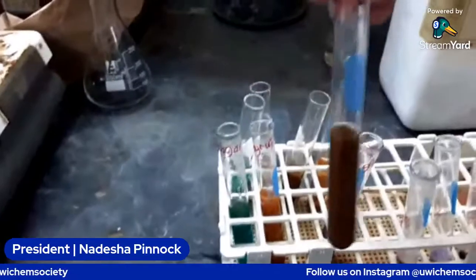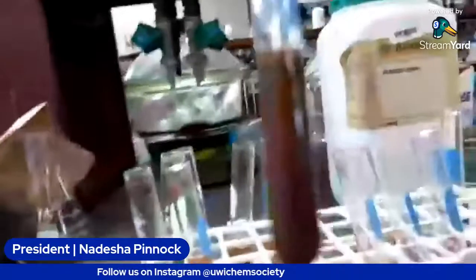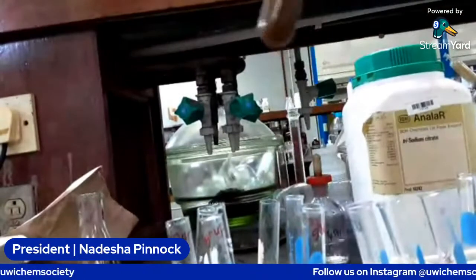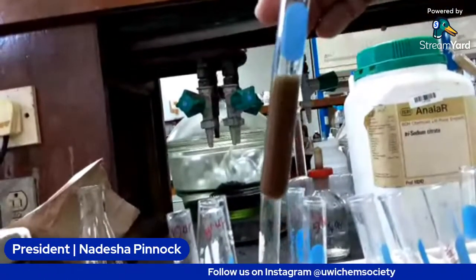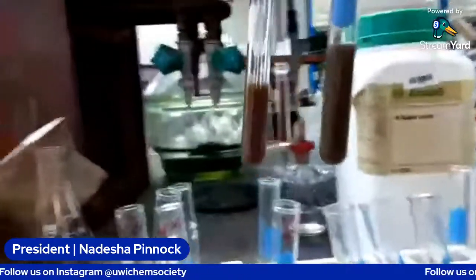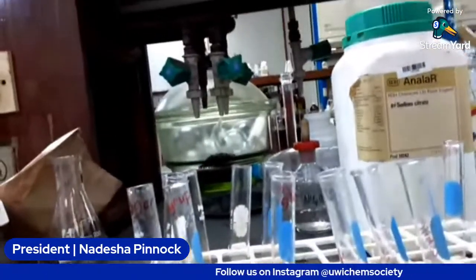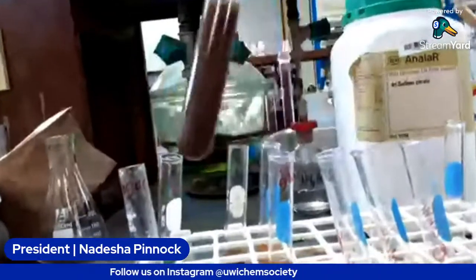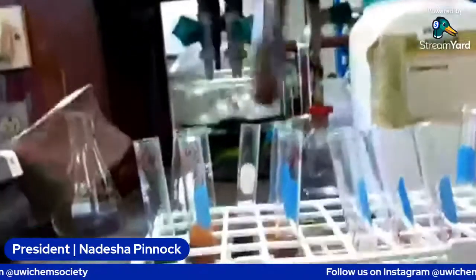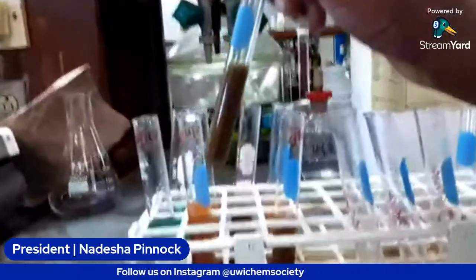And this is the juice, which looks brownish, so I can assume it has some sugar in it, but it probably has a lot of other stuff in it as well, which is why it looks this color. So that's the one that we had before. I mean, it's clear that it has some sugar in it because it has kind of a tint as if it's going to orange, but not quite there. It's more just brown. But of course, we know that juice has a lot more things in it than just sugar.